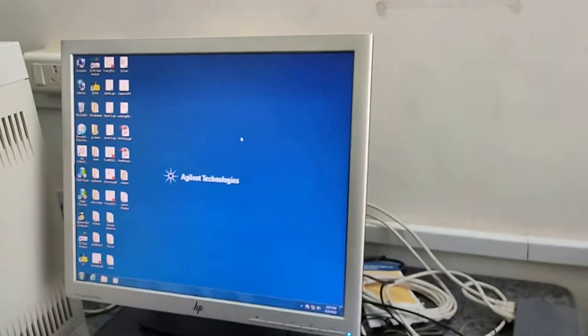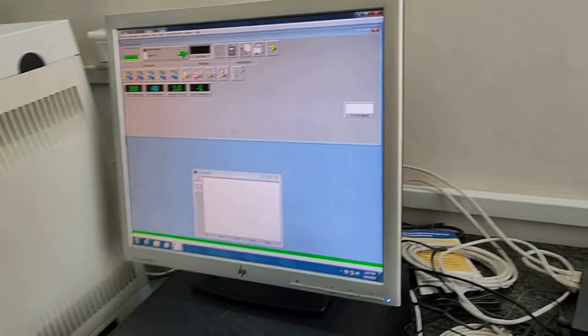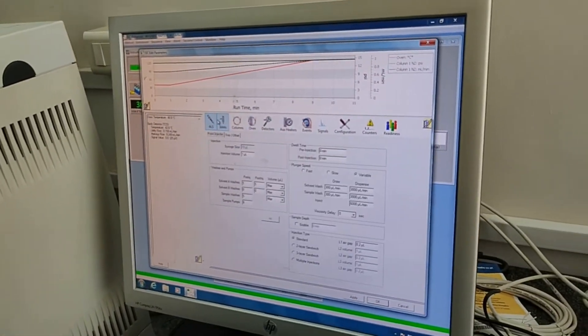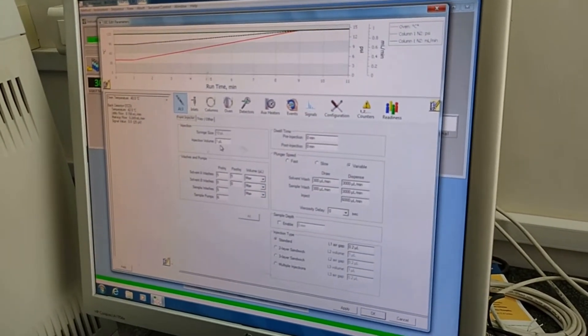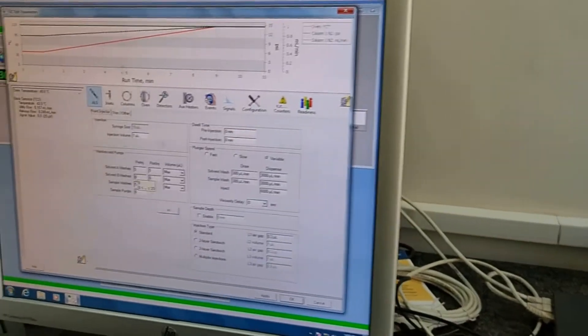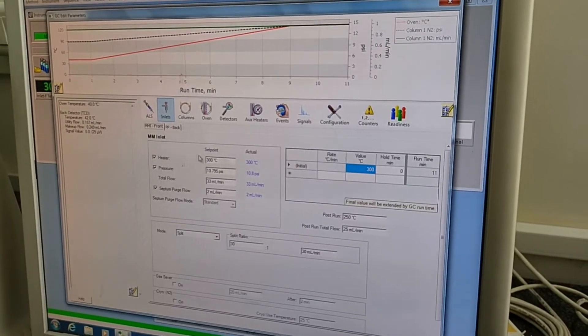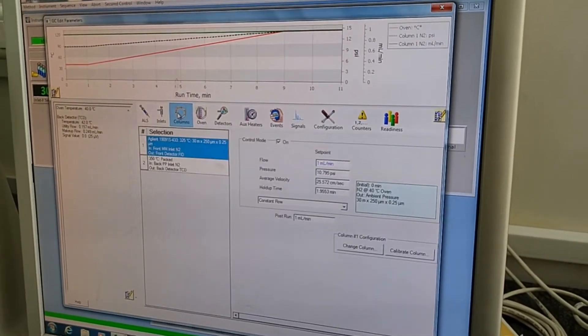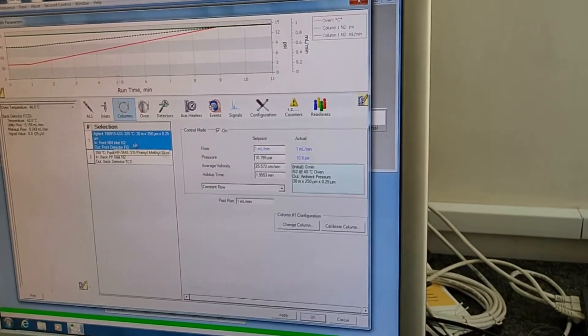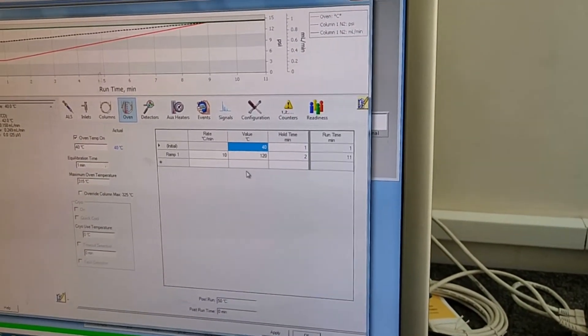Now we are operating this instrument by the software tool. The software name is GC. Now click on it. It is charged up. We are operating by using the software tool. Going to the instrumentation part. First going to this part. This is the injection volume, how much we are injecting by injection syringe, 1 microliter. This is the inlet washing pump, washing 5 times, pre and post sample pumping 6 times. Now then go to the inlet part. You can see the heater, pressure, flow rate pumping. Then going to the column part which column you can connect. This is our column. Now this is the oven. This is the main part of developing the method.